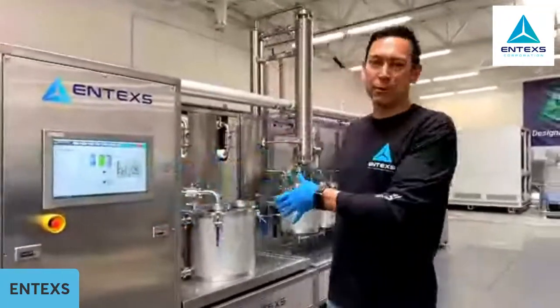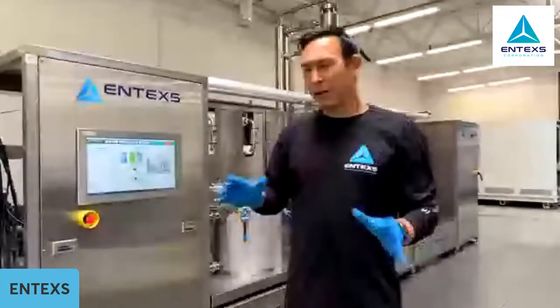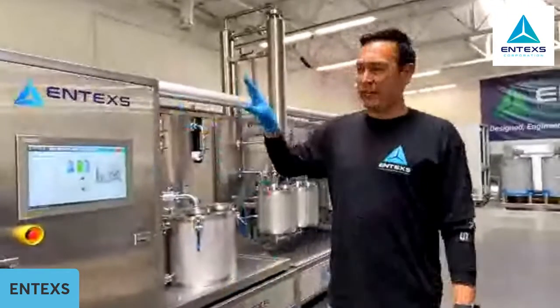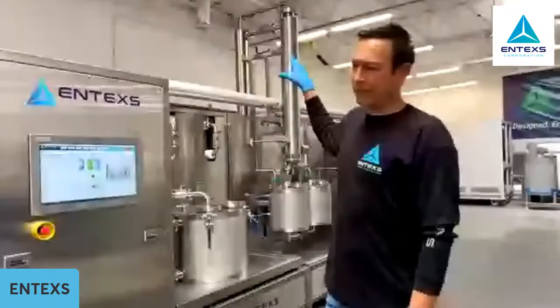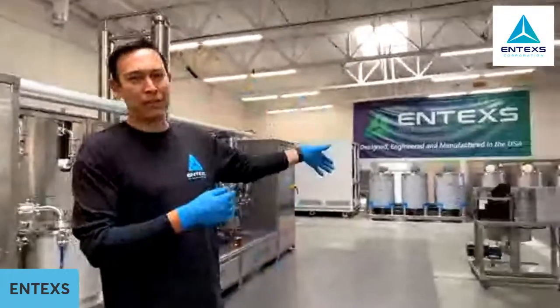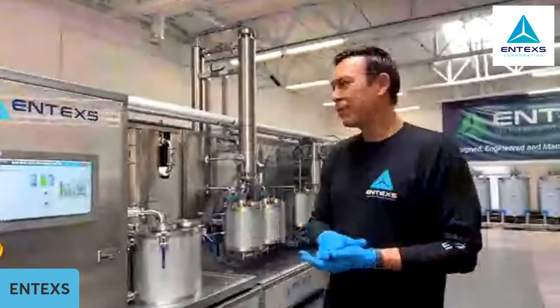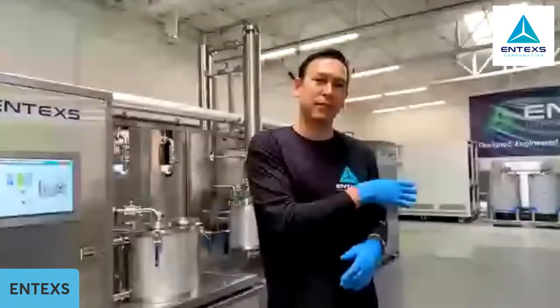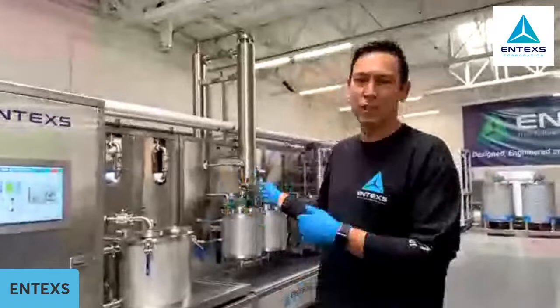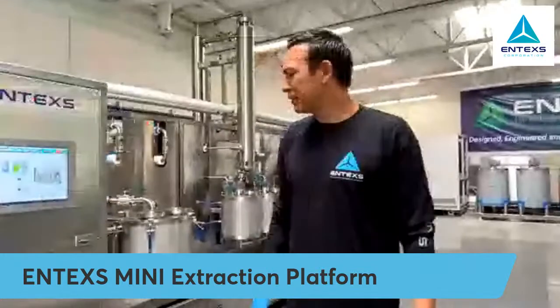If you joined us a few weeks back, we walked through our mini-system. We were running a few batches of products and walking through the operation of the equipment. So today I'm keeping the noise down a little bit in the lab. I don't have the headphones on, so the equipment's not live — the vacuum systems, air compressors, and whatnot. The focus of today is really to walk through the R&D system.